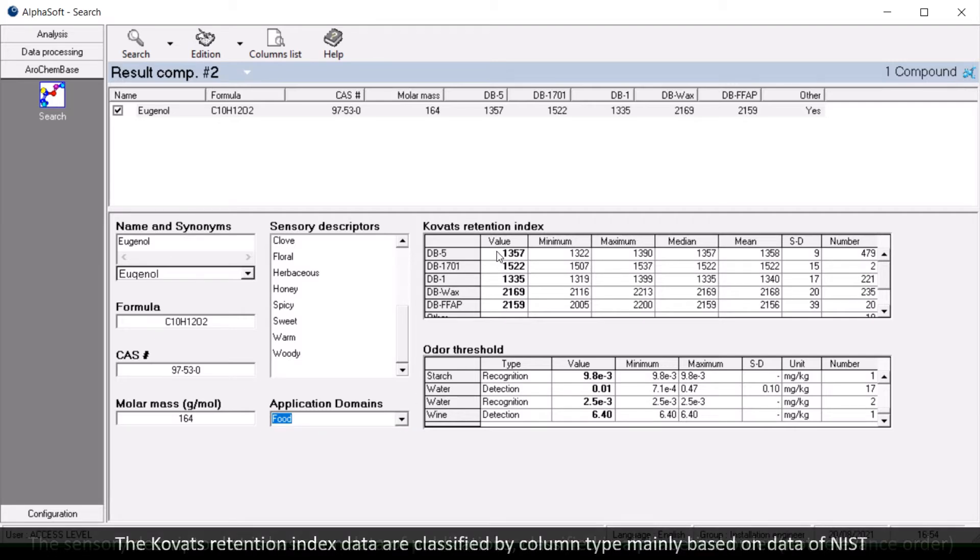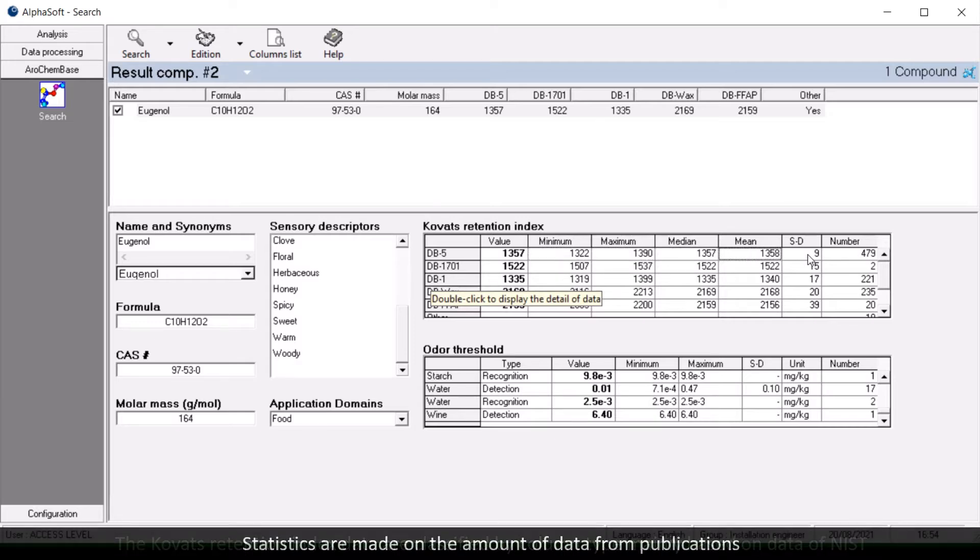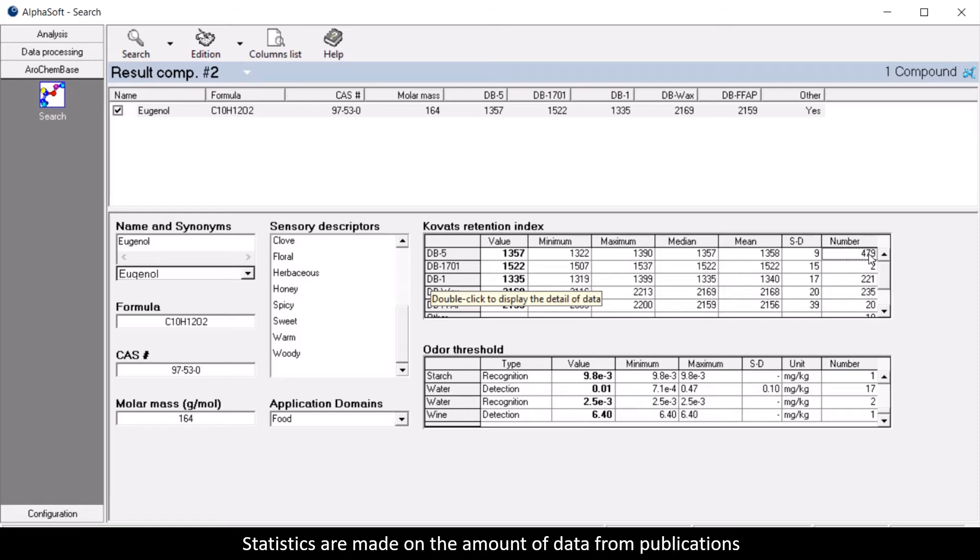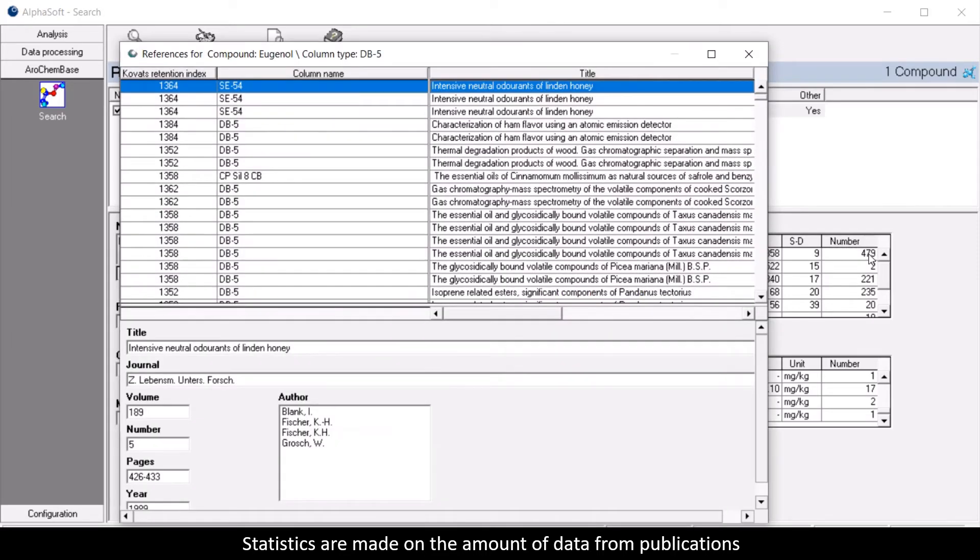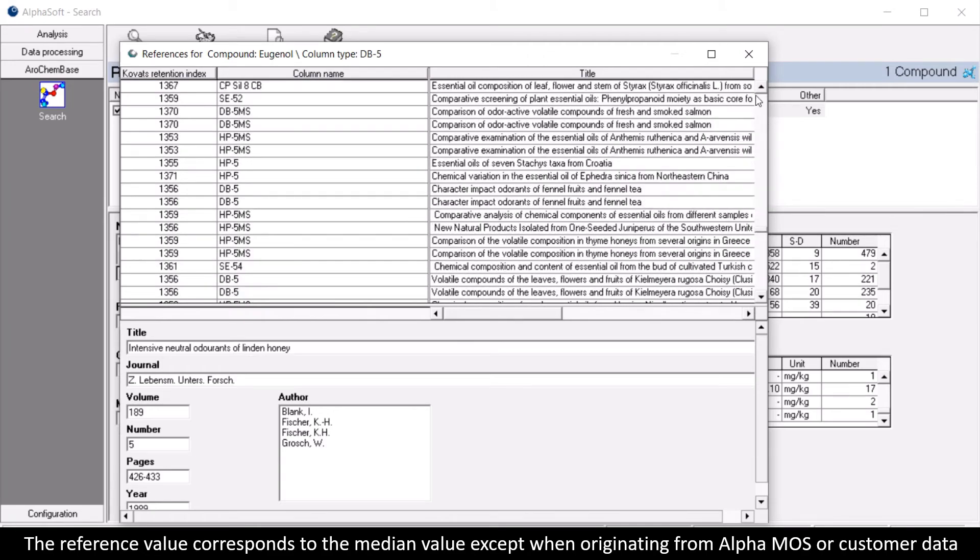The Kovats retention index data are classified by column type, mainly based on data from NIST. Statistics are made on the amount of data from publications. The reference value corresponds to the median value except when originating from Alpha MOS or customer data.